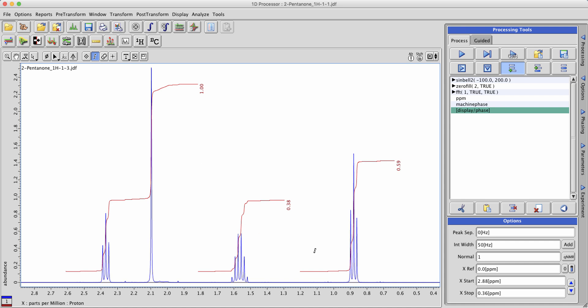If you'd like you could always go through and resize integrals if they've been created in a way you don't like. For example let's take the integral of this triplet here which is probably a bit wider than how we would integrate it if we wanted to do it by hand.